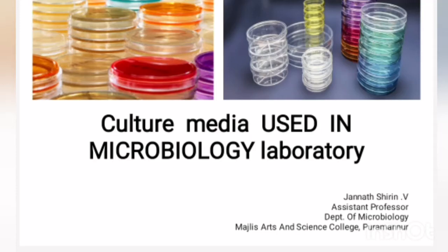Hi, dear students. Today I am going to talk about culture media used in the microbiological laboratory.